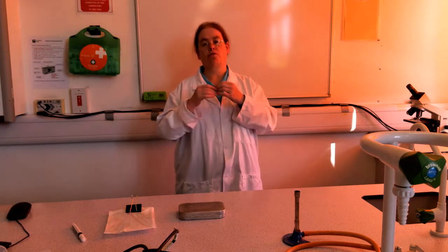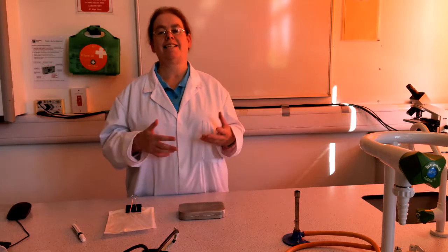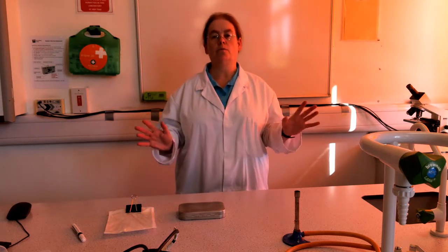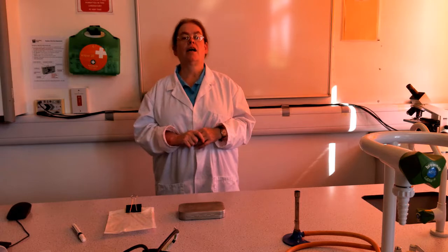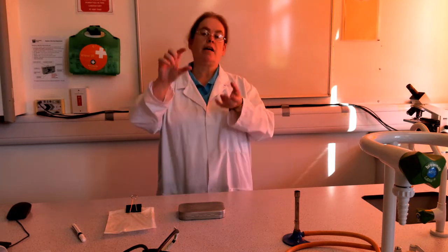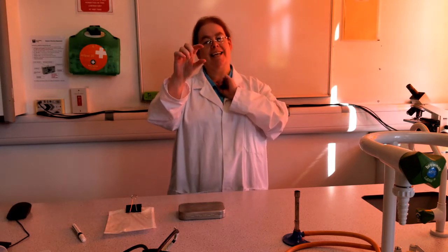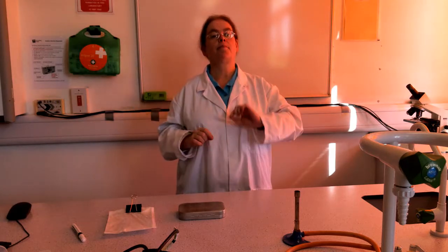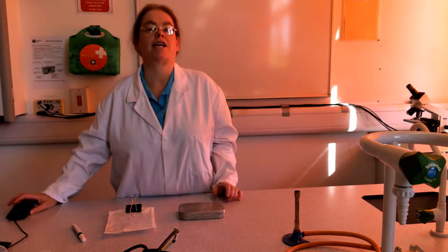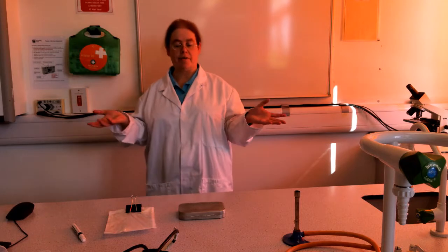I don't want to put bacteria in case I contaminate the spectrophotometers, which are not designated as biohazard, so we won't actually demonstrate that. But basically, you just take your culture with your bacteria in, put it in a cuvette, a little clear container like a mini test tube, put it in the spectrophotometer and a number comes up which tells you how much light is currently getting through the culture. The less light that's getting through, the more bacteria there are. Simples.